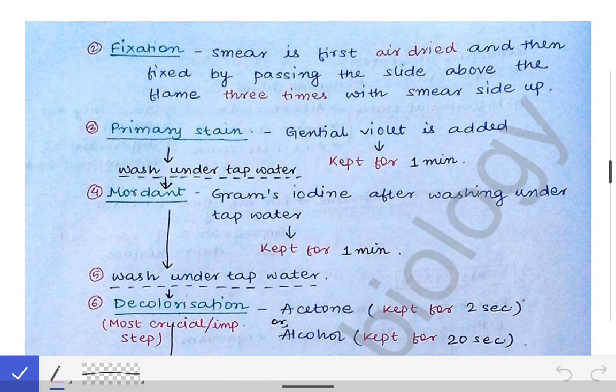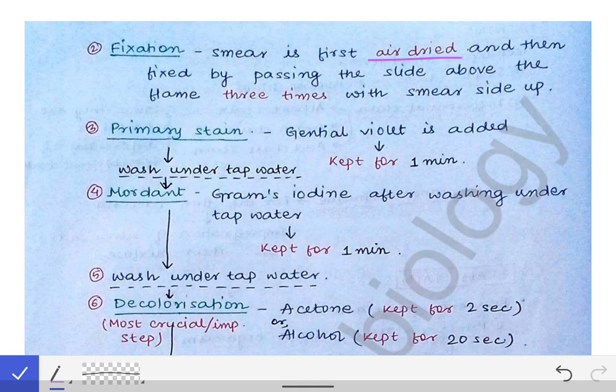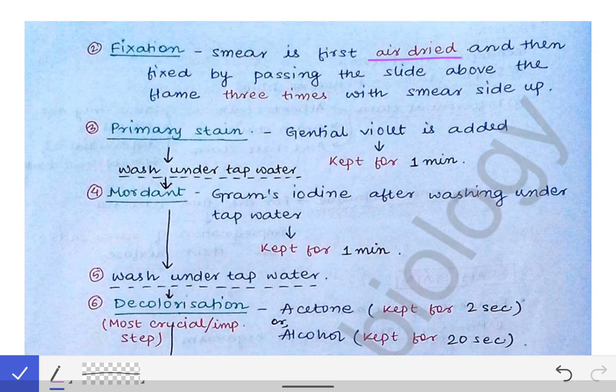Next is fixation of the smear on the glass slide. For fixation, we first do air drying — we keep the slide open in air and wait until it is fully dried. You should not keep it under a ceiling fan; just leave it on the rack and it will dry on its own by air.